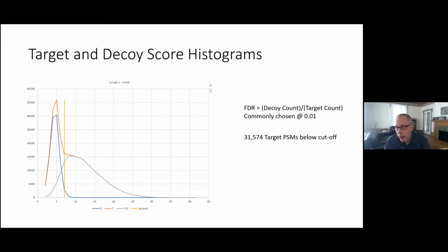Right. All right. So the only difference is that we do exactly the same kind of graph at the peptide level. There's no difference. But what we do is we take the top scoring PSM for each peptide sequence. For one peptide sequence, you might see 5 or 10 or 15 or 20 different spectral matches. We simply pick the top scoring one to put in the table, okay?